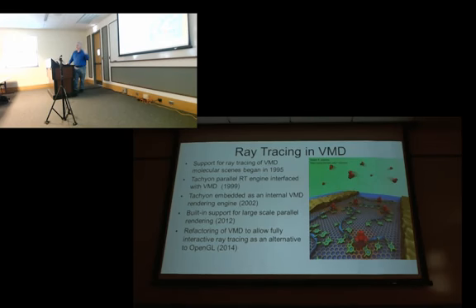But what we want is to exploit the intuition of the viewer to understand the complex structure that you're looking at in 3D. If you looked at a scene like this room, you would immediately understand all the spatial relationships. You'd feel like you're there if it's properly shaded. The same is true of the molecule. The scale is wildly off, but that's the value of it for us.